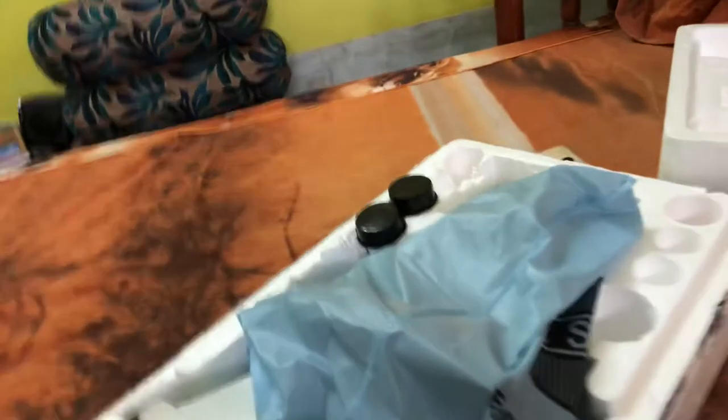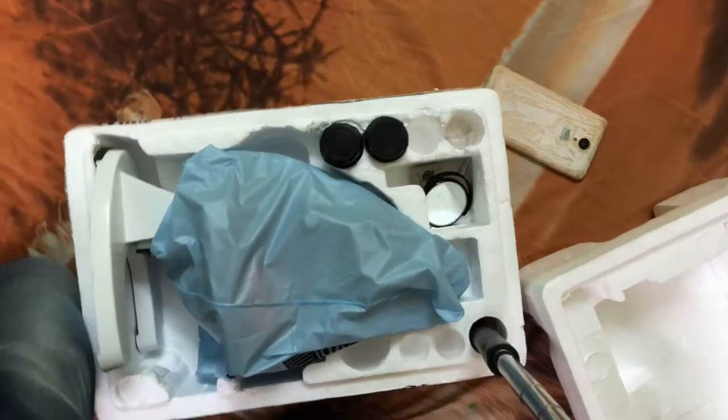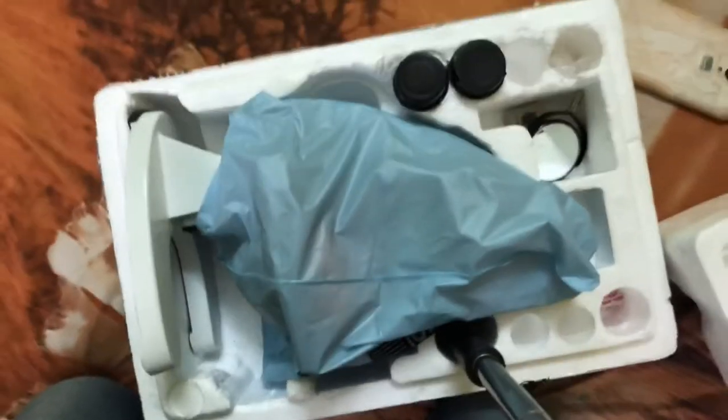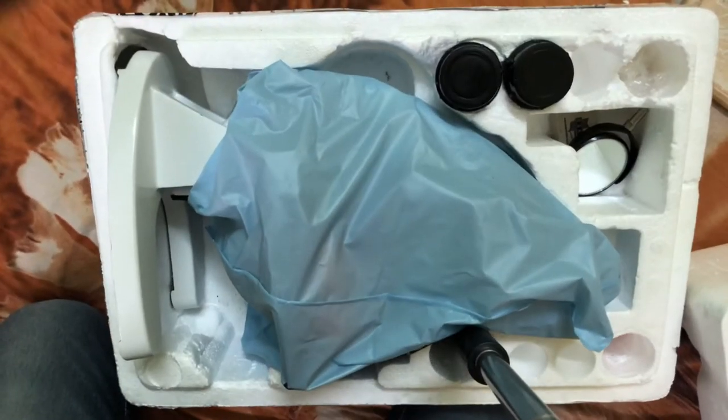And now, I'm going to open it. Really going to open it. Ready? I'm going to open it right now. I can't wait to open it. Let's start. All right. Now, zoom in a little. That's right? Yes. Okay. Good.